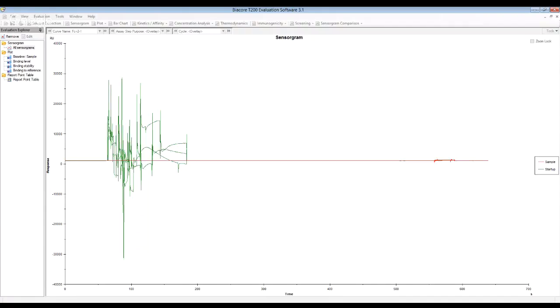You right click and then drag, and then say remove selection. It removes it. Sometimes you get spikes in the middle of your data and you might want to remove them. You can again right click and say remove. But right now I don't want to, so I'm going to keep the data as is.